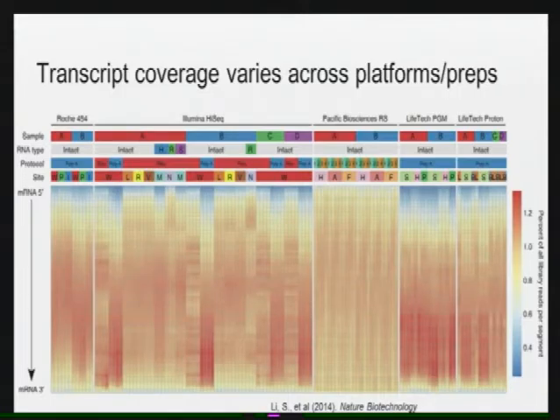That's right. The PacBio does have a single pore, and they have a polymerase sitting at the bottom of the pore. And then they have fluorescent labeling on each of the nucleotides. Basically it's a channel, so you get a tunneling effect. The fluorescence, as it gets right to the pore, is amplified by the shape of the cavity. So they're detecting single molecule events. Right, but they don't start with a fragmentation step, whereas with the Illumina, you start with transcripts and you fragment them into smaller pieces. PacBio doesn't do that. They're working with a single molecule. It's been a few years since I was listening to all the PacBio talks, so I'm not as up on that.